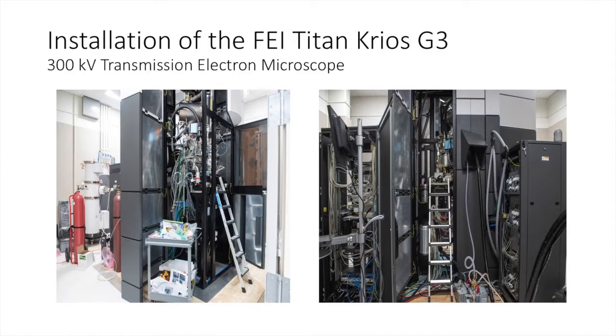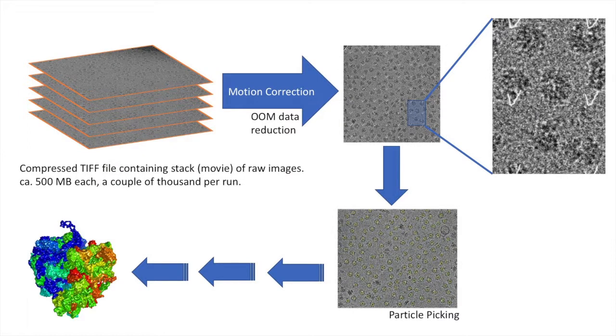So what do we do? What we do is we have a complicated sample preparation technique called vitrification. It is complicated, but if you see it done, it's actually a miracle that it even works. It's kind of like an ad hoc way of getting your protein embedded in ice. But after you get your protein embedded in vitrified ice, you expose it, and you will get this micrograph, a typical micrograph over here. Is there a laser pointer? Yes. You get a micrograph.